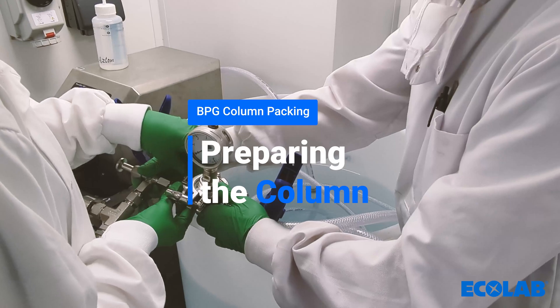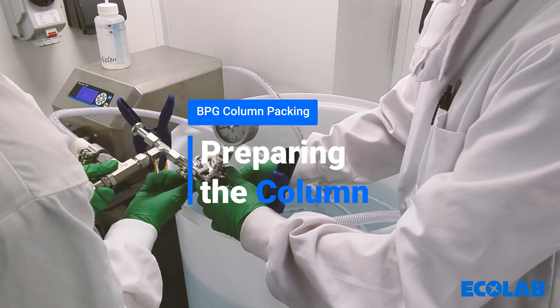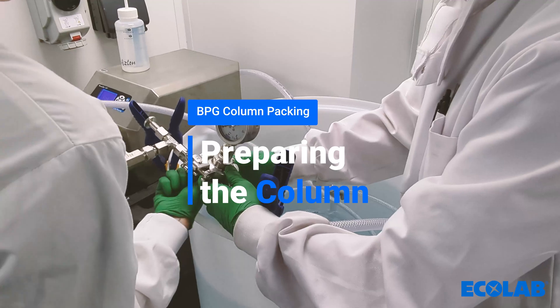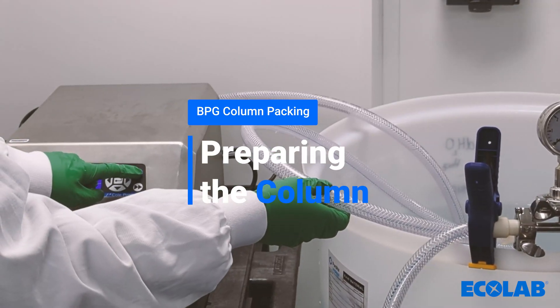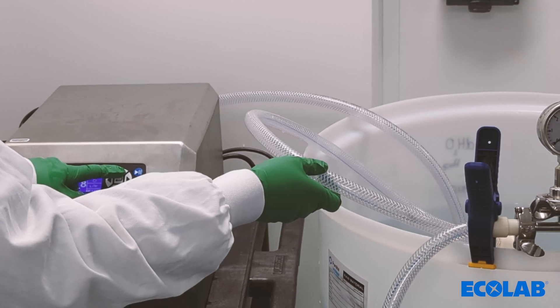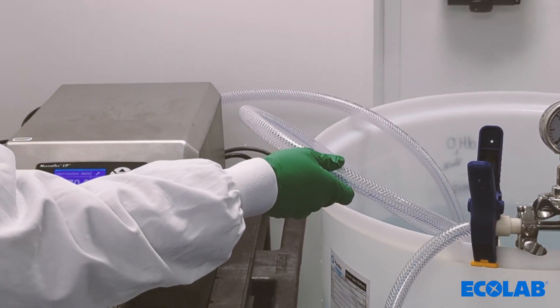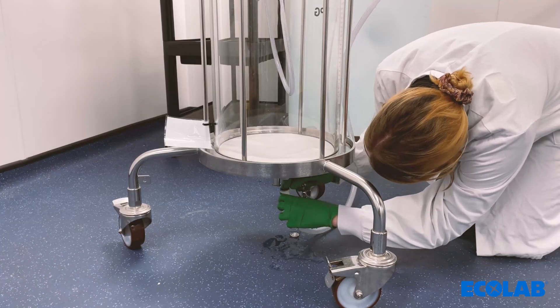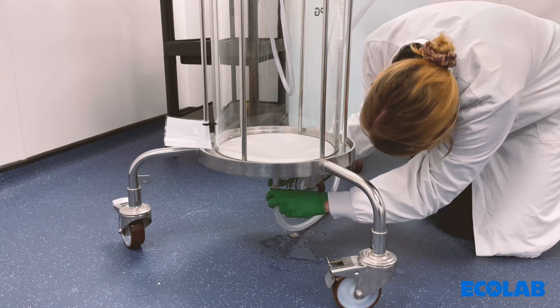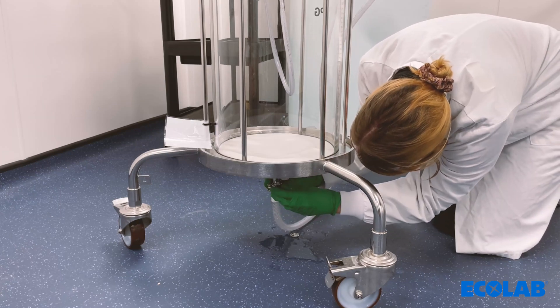Prior to priming the column, the system or pump to be used needs to be set up with a pre-column relief valve and a pressure gauge. The lines will need to be primed to remove any air present. Ensure that the gaskets are correctly aligned to avoid any leaking during packing. The bottom of the column can now be attached and a low flow applied to add one to two centimetres of water to displace any air.